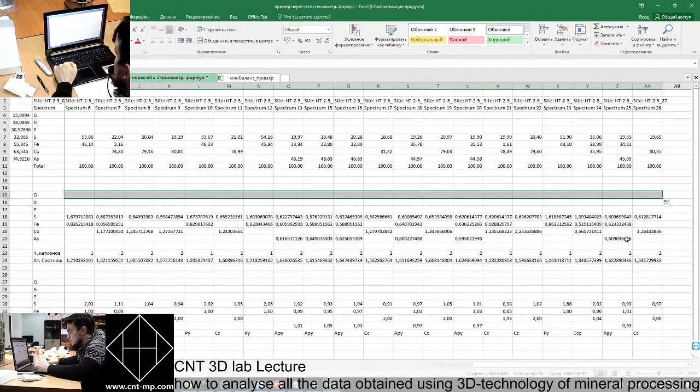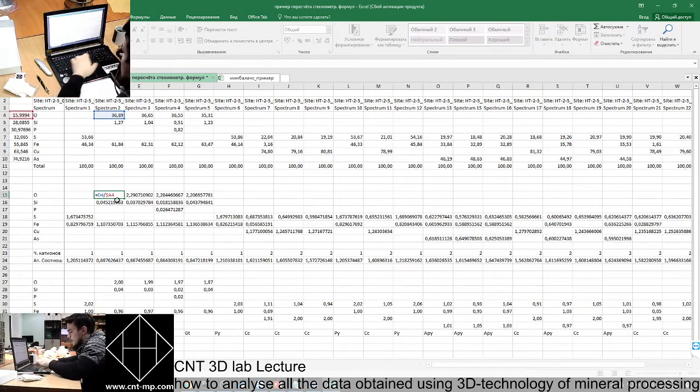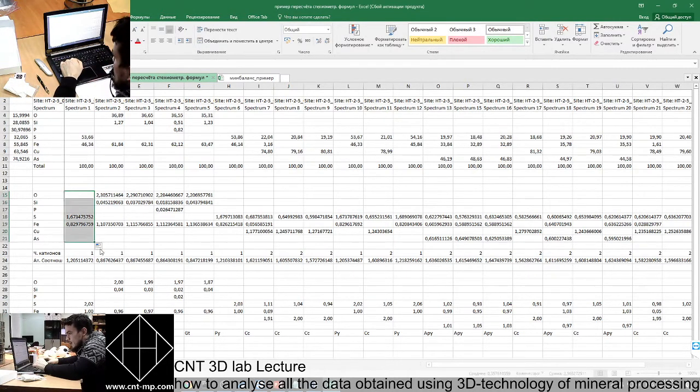We just pull down the whole formula. So we assign it one time, and then it can automatically be reassigned for each cell its value.